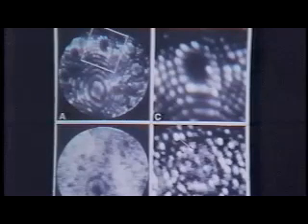Well, in some cases it is. Now, obviously, in cases in which you're interested in looking at a precipitate particle within a lattice, and that precipitate particle is much smaller than the radius of the tip, you don't care. It's there, and it's not constrained in some way by this volume of material that you have to work with. But suppose you were looking at something else, something that was much larger.